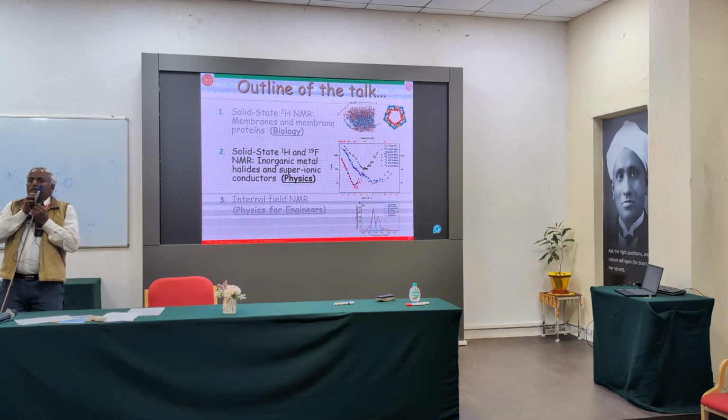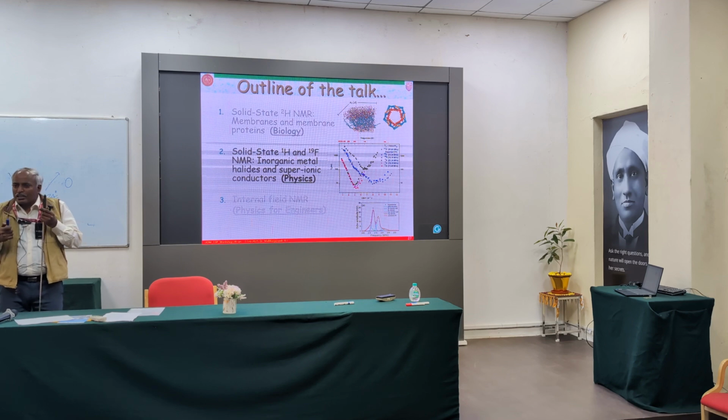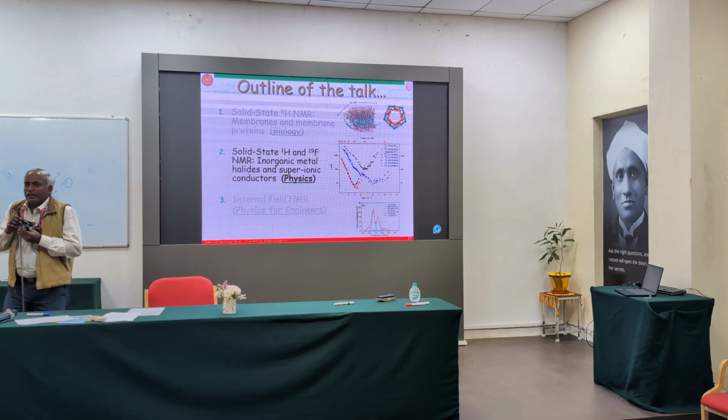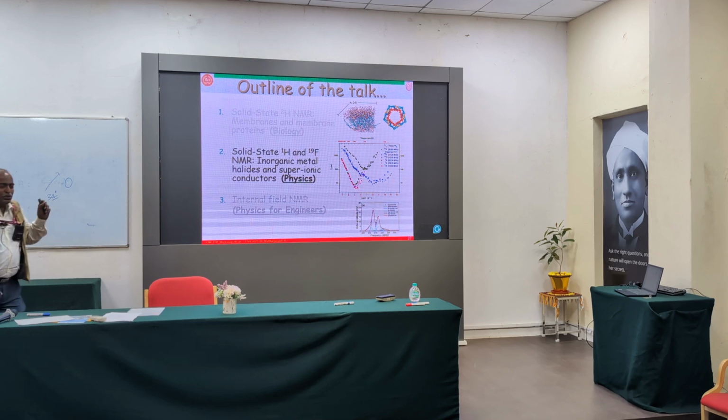How do they rotate it? They send a gas with a particular speed, 1 kilohertz, 10 kilohertz speed, to make it rotate. Then it looks as if, like in liquids where atoms are moving, here also spin systems are moving. Artificially they make it. Then I get wonderful, high resolution spectra and individual peaks. Otherwise you don't get individual peaks in a regular solid state NMR spectra.